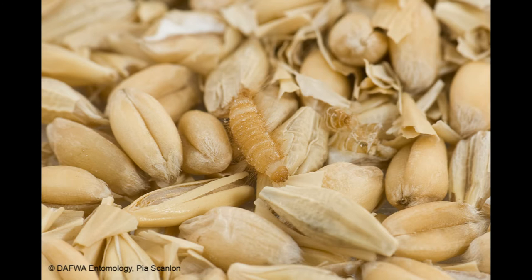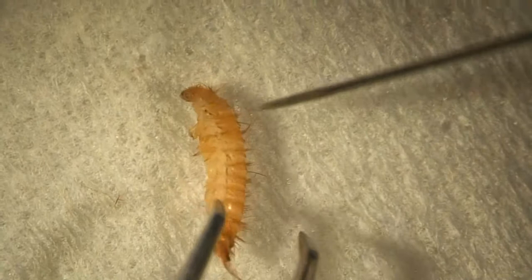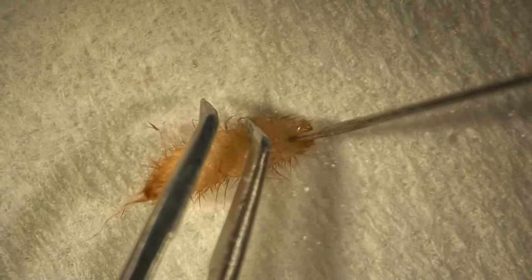Here we will detail the steps needed to prepare Trogoderma larvae for identification on microscope slides. To begin, fresh larvae are killed by placing them in near-boiling water for a minute or two. This also acts to stabilise the DNA if it is to be extracted later.